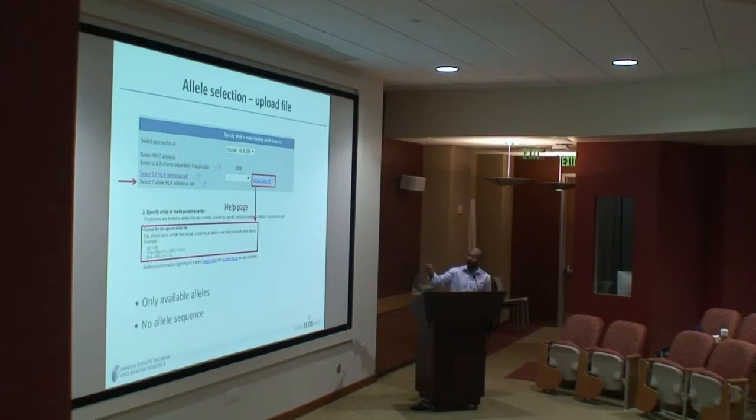And again, if you have a specific set of alleles that you want to do the prediction for again and again for repeated analysis, you can save that as a plain text file and upload that allele file. So for example, you have a lot of different data sets. You don't have to go to the drop-down menu and select every time. You can save that as a plain text file and upload that allele file.